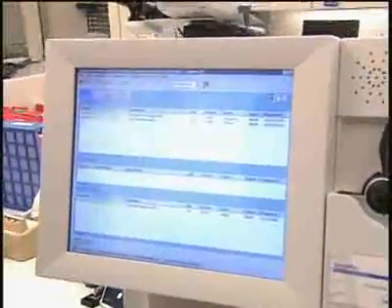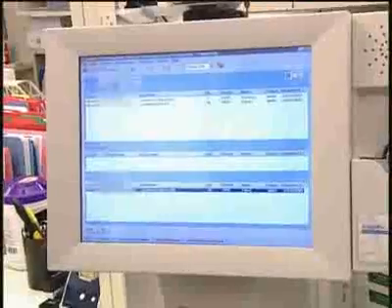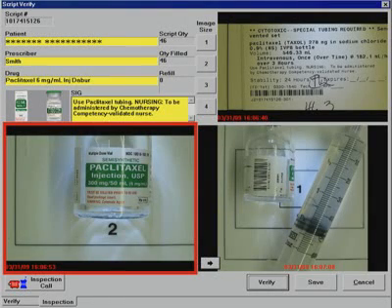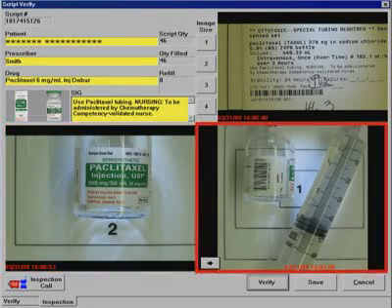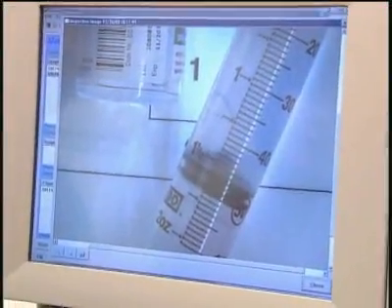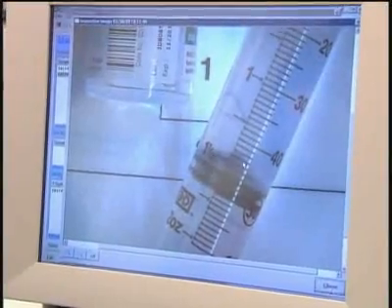Right. Okay, so I have one more. I have paclitaxel. Double click it, and it'll bring that one up. I have 278 milligrams, and I have paclitaxel. This is 6 milligrams per mil, so I should have 46.3 mils. So there's 45, there's 46.3. And also I can see the expiration there, 11/2010.